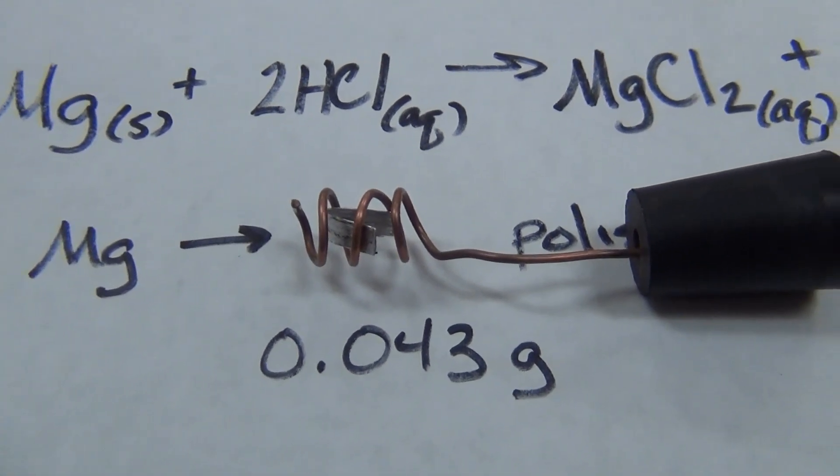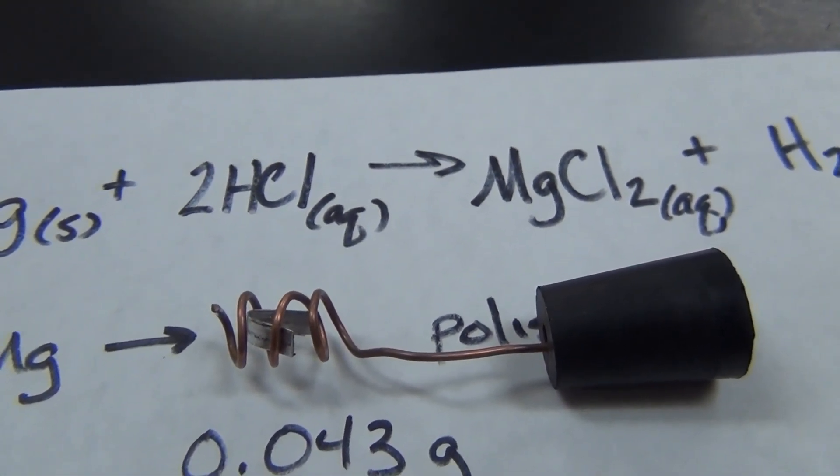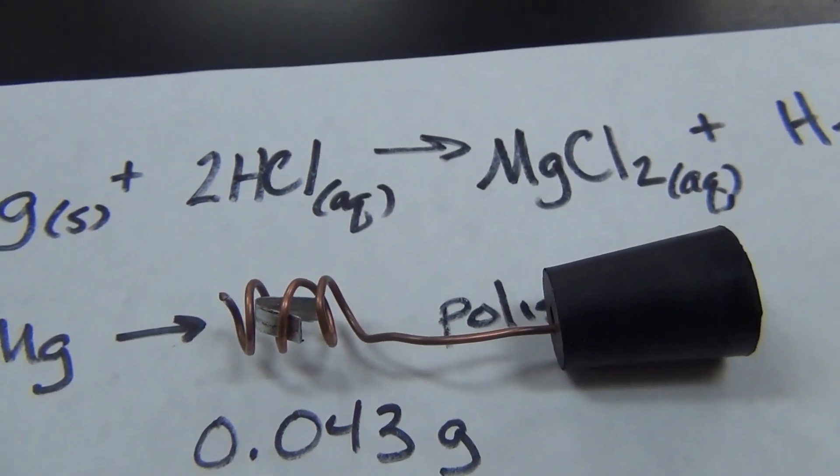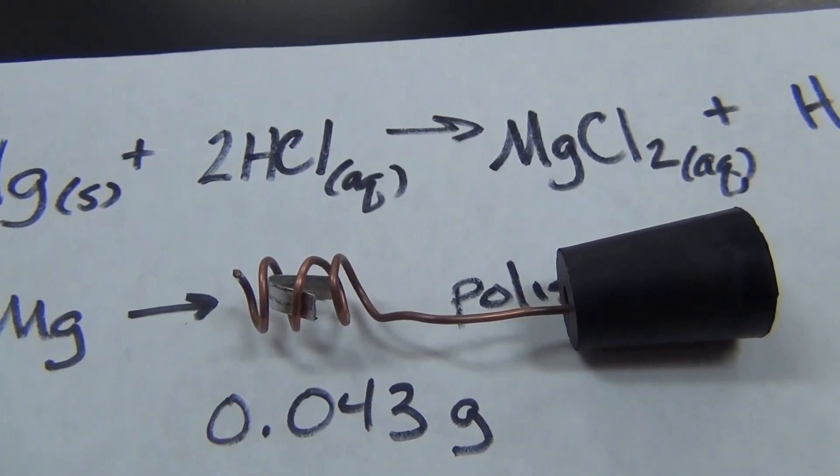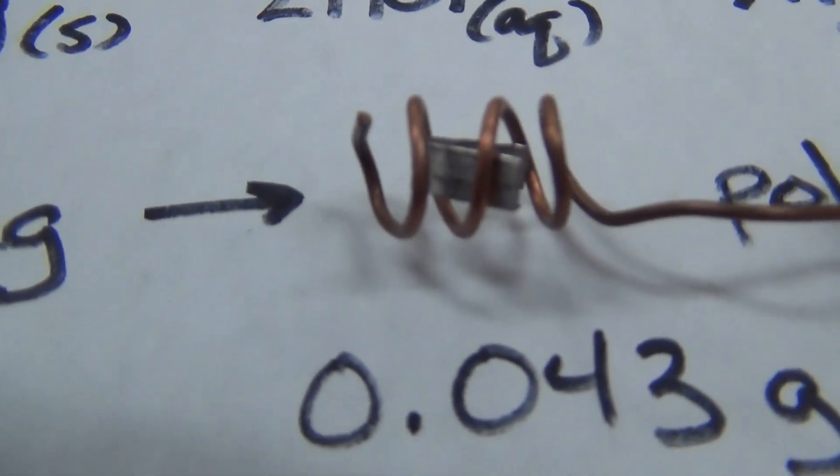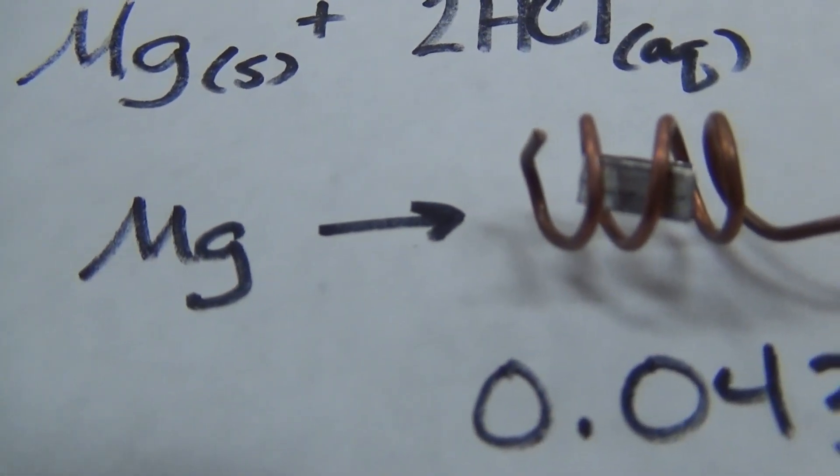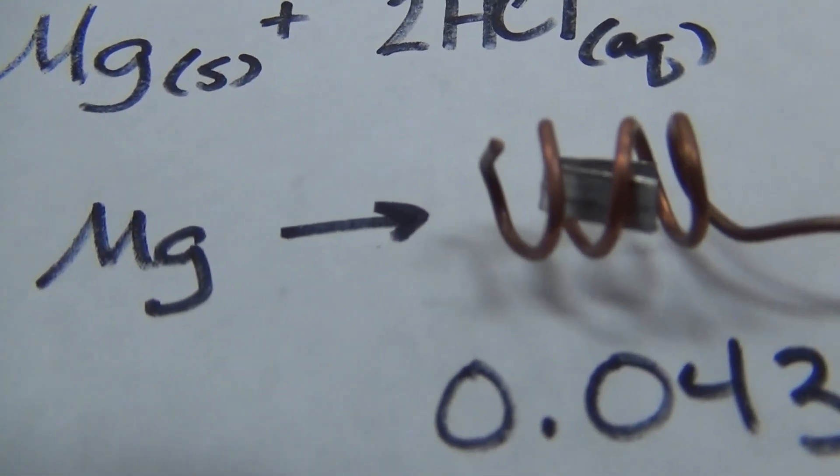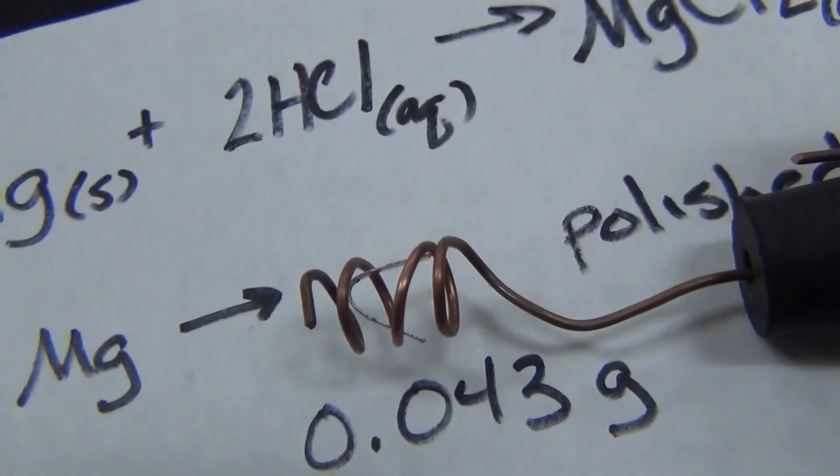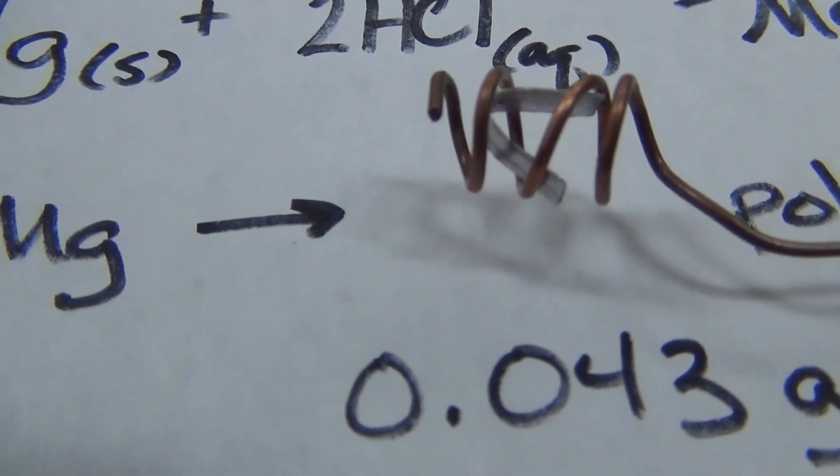So in order to do this reaction, I need to be able to keep this in the measuring device. So I made a little cage out of some copper wire because copper does not react with hydrochloric acid and the magnesium will. And you can see the magnesium strip. I've just bent it over into a little U shape. And the magnesium strip is stuck up into the cage.